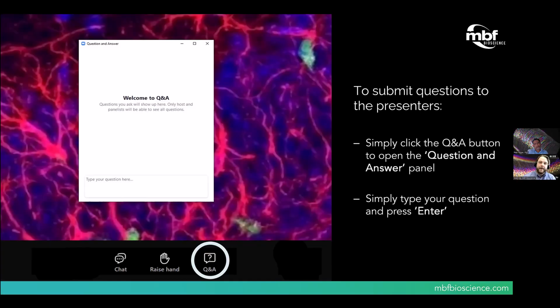You can turn on and off the interpolation as needed. So as you're navigating around the tissue, you can tell if things are out of focus, or you can adjust your offset to see if you can make a certain portion of the tissue that you're looking at in your field of view more in focus. If you need more points, you can then add them at that point.